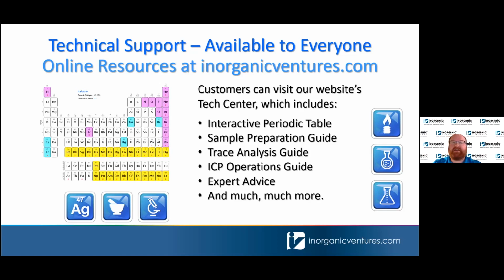I've done a lot of trace metals on acids and bases over the years, and I have noticed that tin is a common contaminant in HCl. So you might want to get a sample of some of that C star acid or Optima grade acid, whatever they call it, that's been doubly distilled, and see if your tin goes down or your tin problems go away. I'm also suspicious it's actually in the lenses of the mass spec or the quadrupole. I've seen it more on mass spec than OES, but you might be able to blame the acid as well.